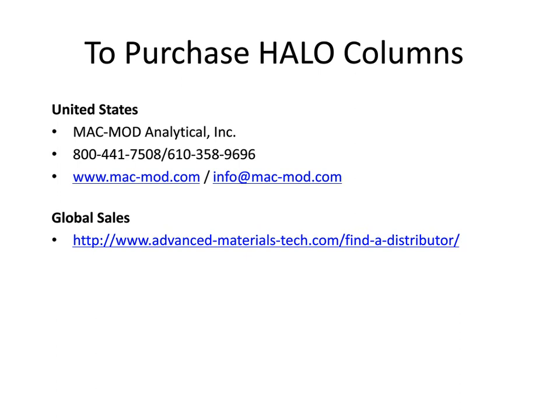All right, great. Thank you, Barry. Next question. Are the new mobile phases compatible with detergents like Lubrol or CHAPS? I do not know because I haven't used those detergents particularly in my mass spectrometer because I tend to shy away from putting detergents anywhere near my mass specs. But I wouldn't imagine that they would show any remarkable differences compared to trifluoroacetic acid.